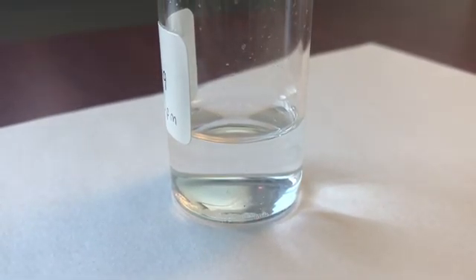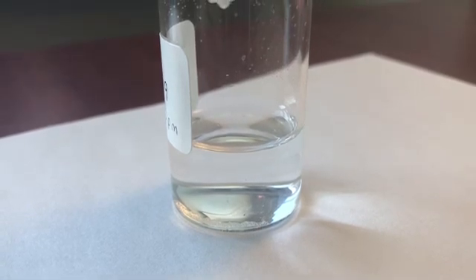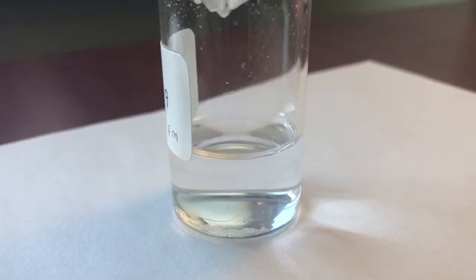Since the experiment, the vial containing our saturated alum solution has been resting on the windowsill in my dorm and the solvent has been evaporating. Let's take a look at the growth of the crystals so far.